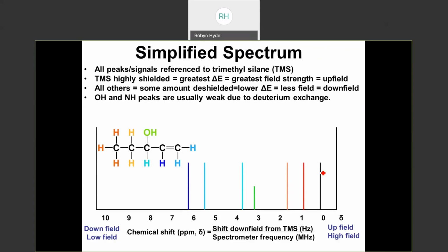But now, to interpretation. What I have here is a simple spectrum. Lots of things to talk about before we can fully understand everything up here. We have a scale from 0 to 10 for proton NMR. Sometimes when I give you data, you might see 0 to 11. The far right-hand side is referred to as upfield or high field. So this end, we say is up or high. I usually tend to use the word up. So this is up to me.